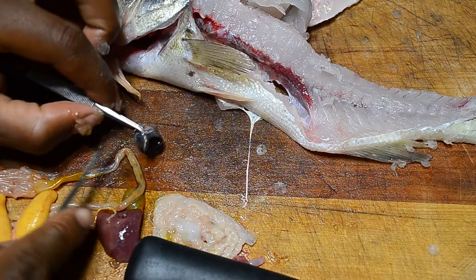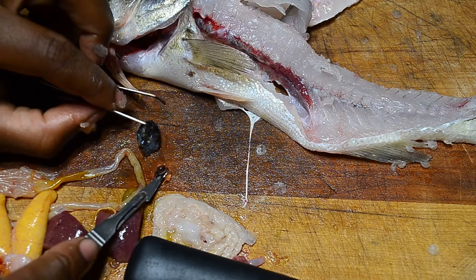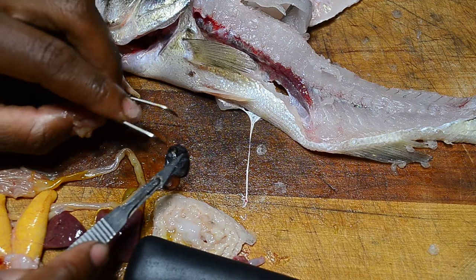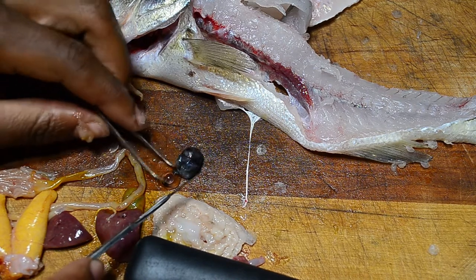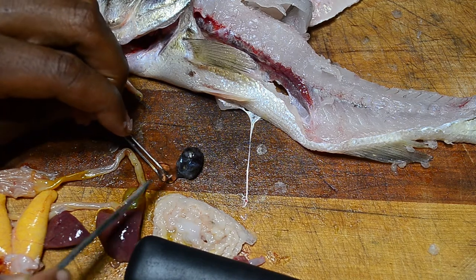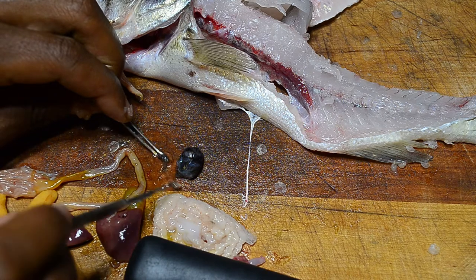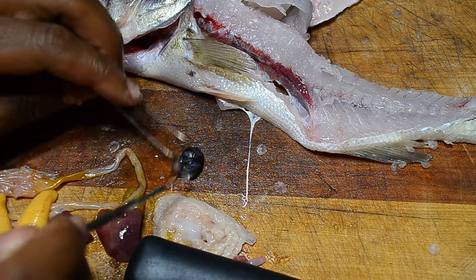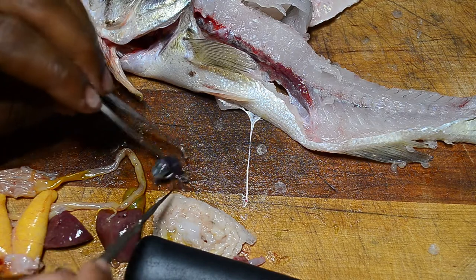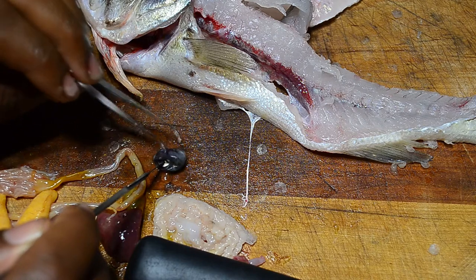I messed that one up because I broke it. At least we have two eyes so we can try again. I don't know much about fish eyes yet — I'm still learning. Pretty cool though!